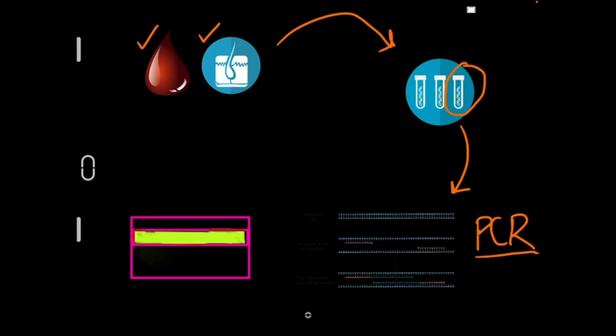The DNA is then fragmented with the help of site recognizing restriction enzymes and is cut to separate VNTRs. This chopped DNA is exposed to electrophoresis over agarose polymer gel, which separates the DNA fragments. The separated VNTRs are recognized by staining them with dye that becomes fluorescent when illuminated with UV radiations. The separated segments are also known as RFLP, that is restriction fragment length polymorphism.